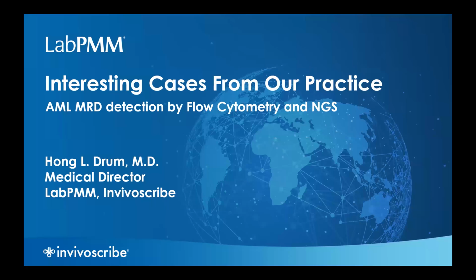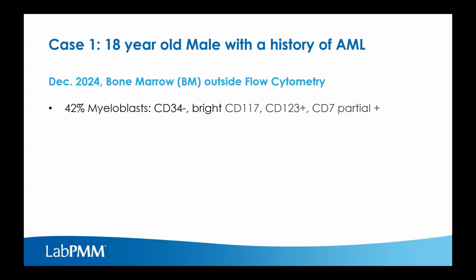Good afternoon. Thanks for the opportunity for sharing a few cases from our practice today. The cases I'm going to show are mainly our AML flow cytometry cases and FLT3 mutation and NPM1 mutation by NGS. Let's look at the first case.